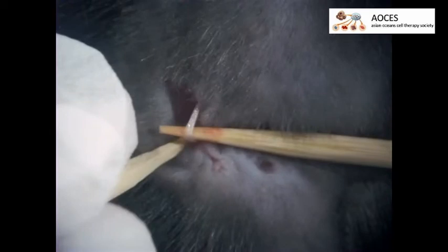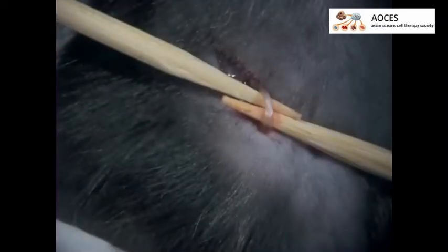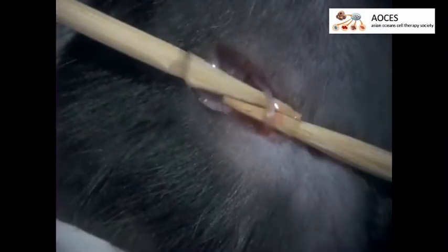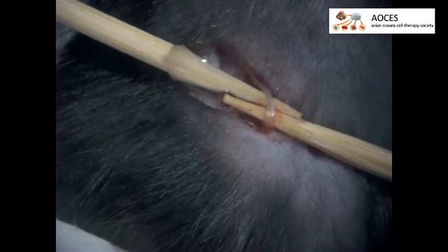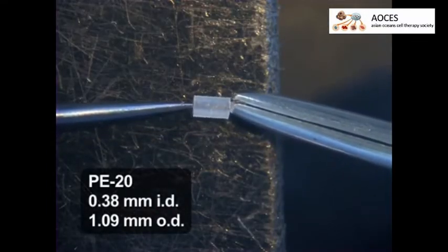The main branch of the sciatic nerve should be made visible. If there is bleeding, be sure to mop it up with the swab. For sham controls, this completes the surgery. For the mice to be cuffed, insert two sticks below the sciatic nerve to expose the main branch, then add a squirt of physiological saline to hydrate the nerve.